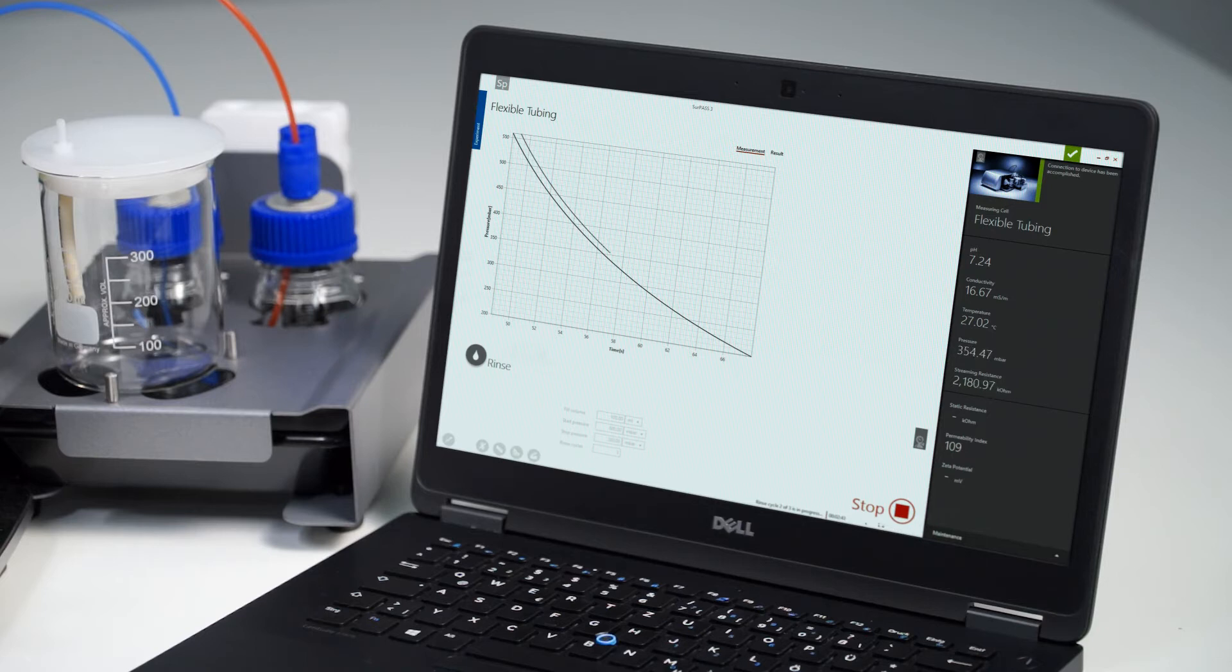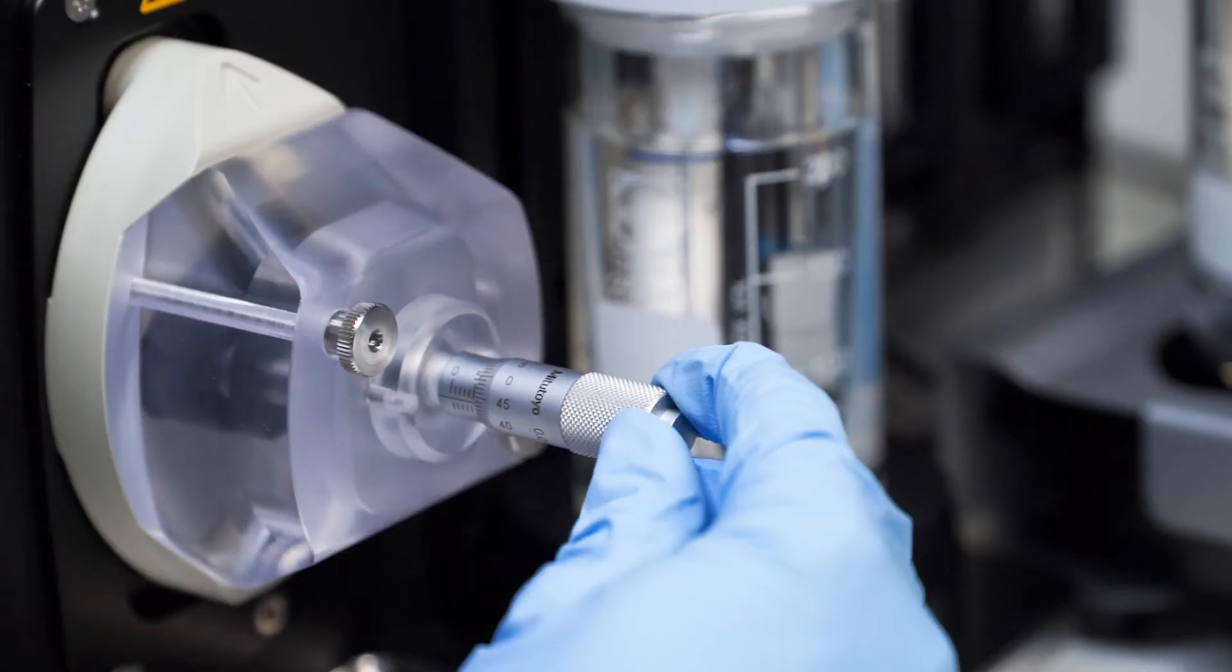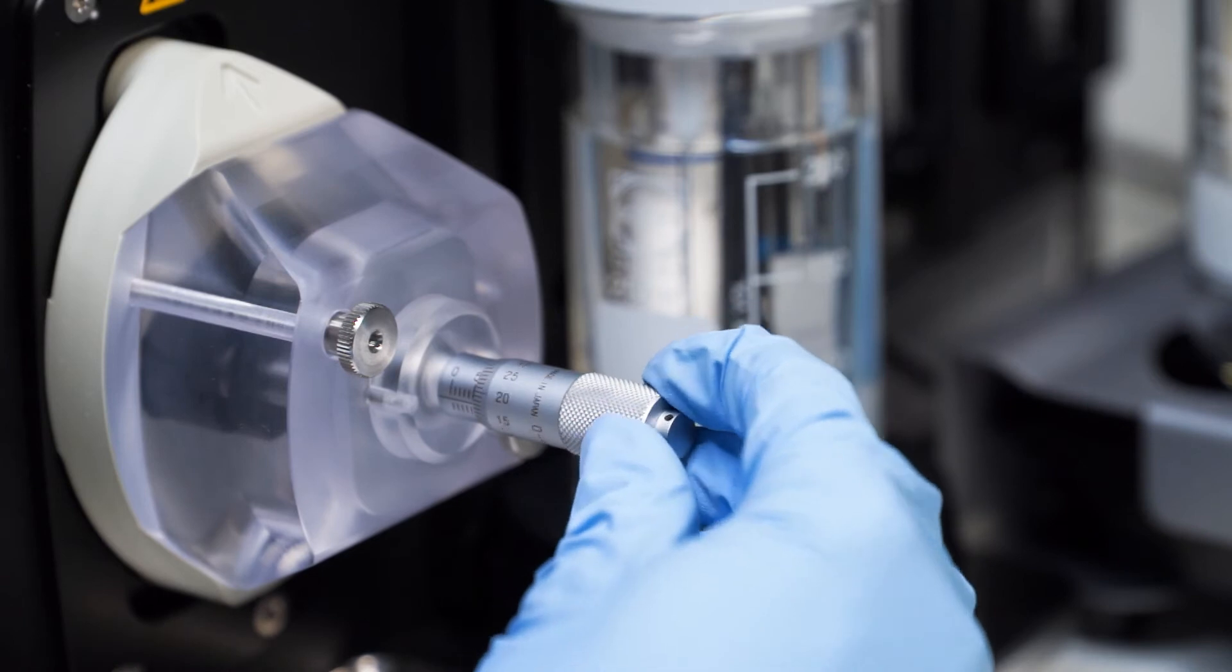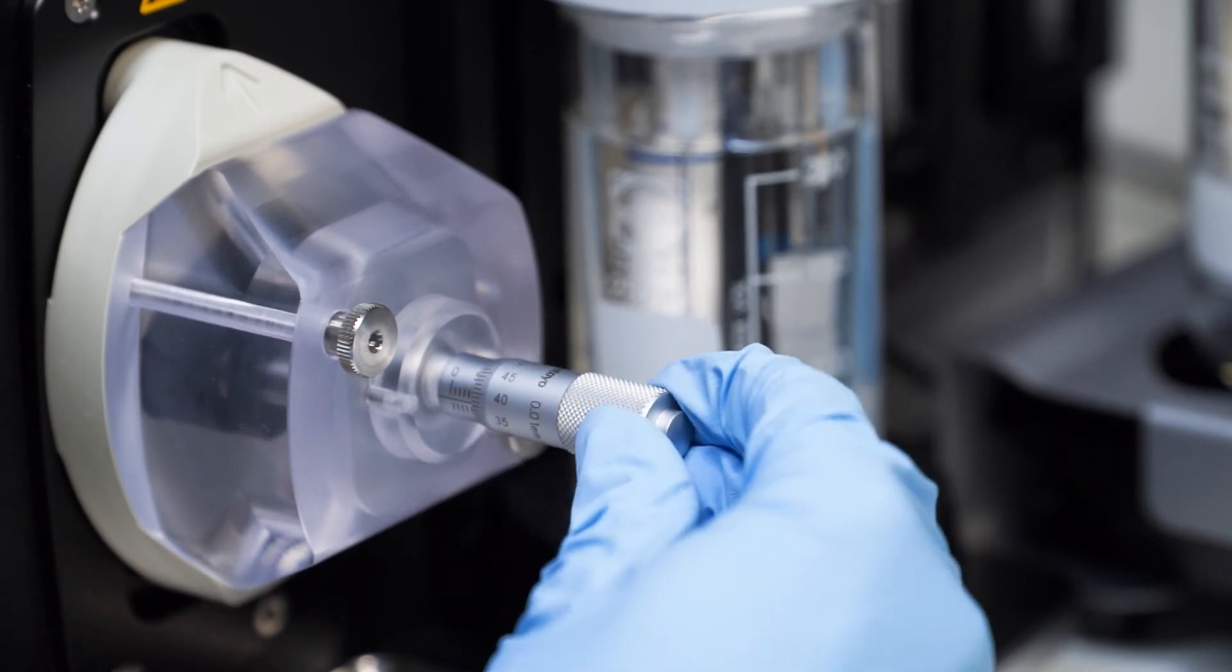Use the rinse cycle to adjust the compression of the tube sample while filling the tube channel with measuring fluid. Adjust the compression of the tube sample by rotating the adjustment knob.